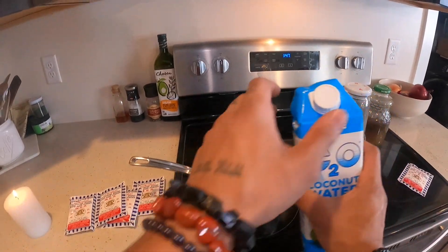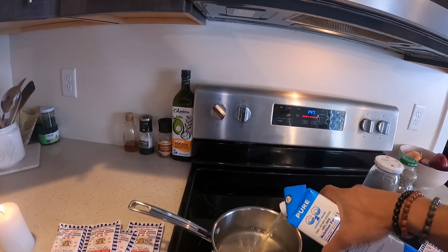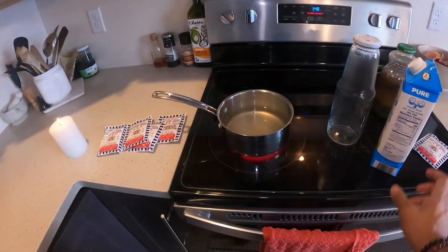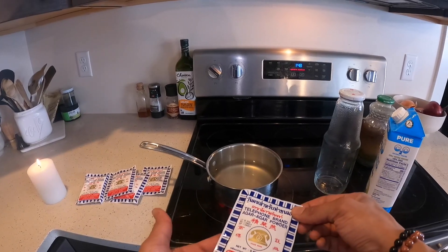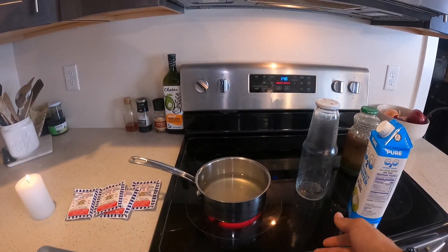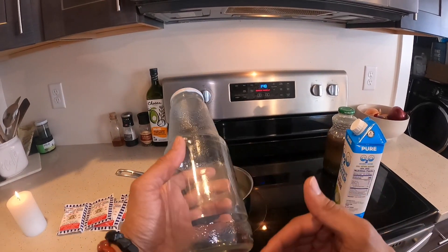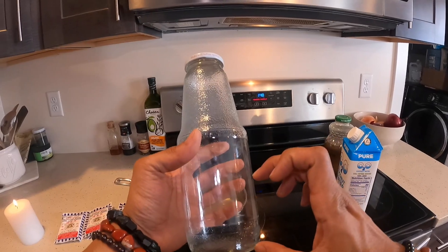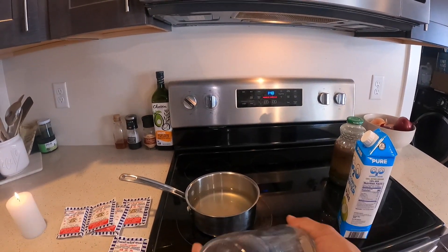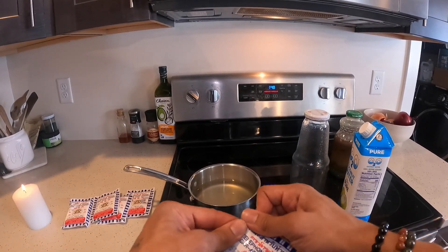I'm going to turn on this little pot on the stove and pour about half my coconut water in here, get it a little bit warm. The reason I'm doing this is to melt and dissolve the agar. If I put the agar into a bottle of cold or room temperature coconut water, the agar won't dissolve and it'll settle to the bottom, making the first few plates pour unevenly. So I want to melt the agar first to get it more homogenized into solution.